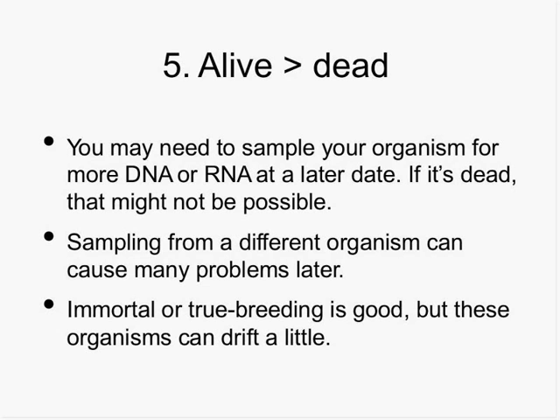If you can't, sometimes things like an immortal cell line or something that's true breeding, Caenorhabditis elegans for example, are good options for you. Possibly this isn't going to be the case. You might be in a situation where you've got a lot of heterozygosity and the things that you sample die soon after you get them. Life will be harder if you do that. Understood that sometimes science is like that, but definitely, if you have some choice, try and keep the thing alive.